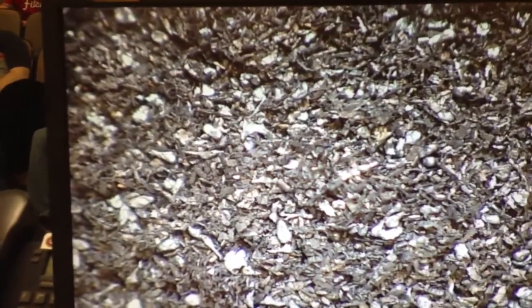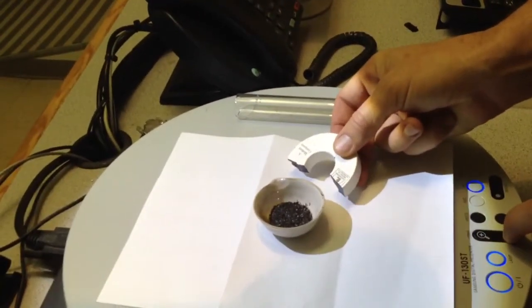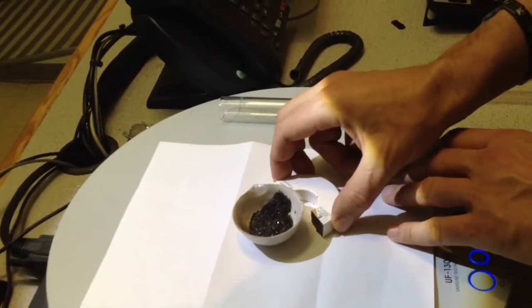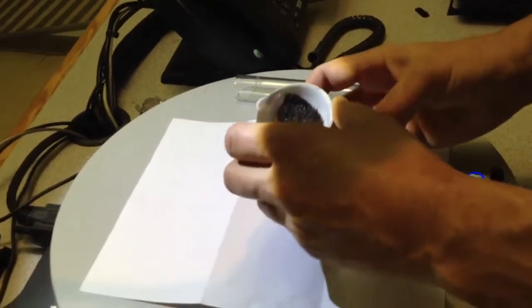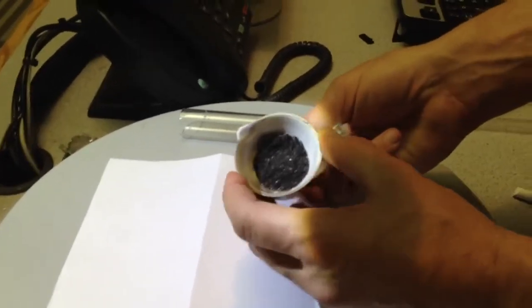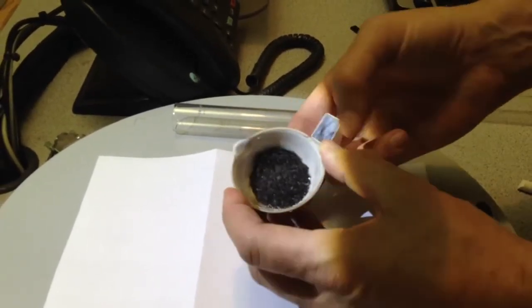Now, one of the things that's a physical property of some materials is magnetism. And this is a magnet, okay? And so, I'm going to show you, hopefully, what effect this magnet has on the material.